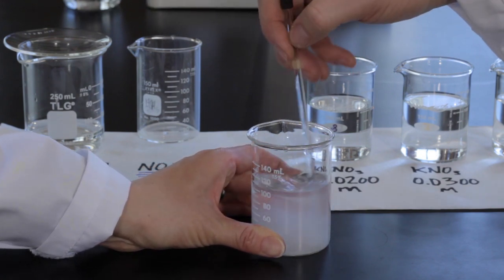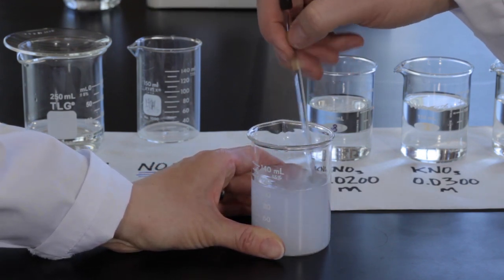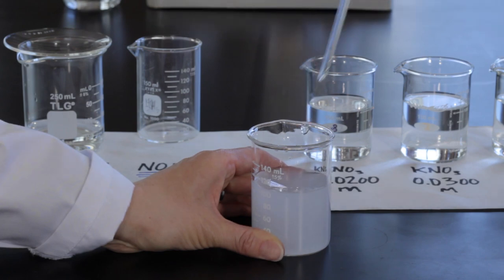Stir the solution vigorously for 5 minutes with a glass stirring rod. Record the temperature of the solution.